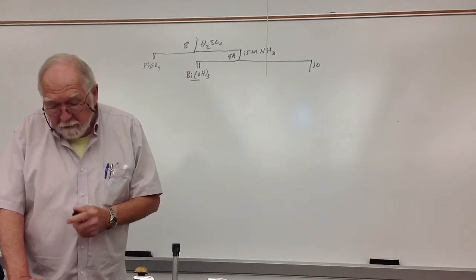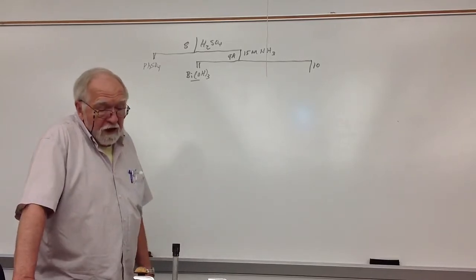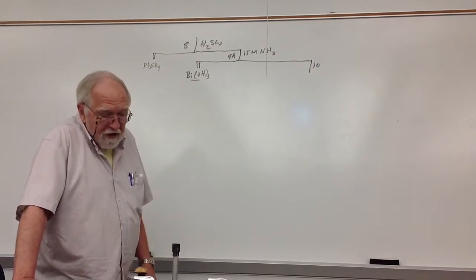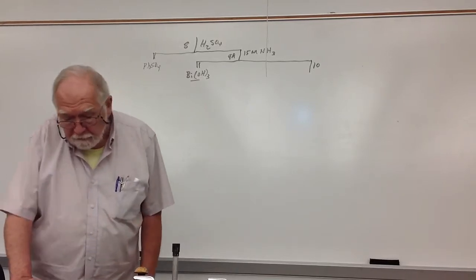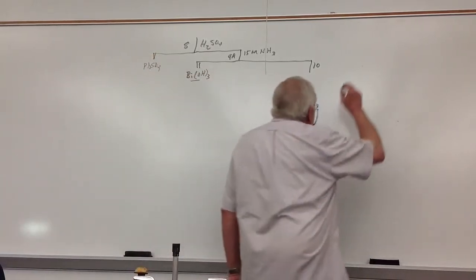The thing I pointed out about the tin 2 chloride, I also mentioned this way back when you did the mercury test. Don't suck up the little pellets of tin in there. And if it's all white and cloudy, something broke down and you want me to refill the bottle with fresh reagent. Okay. So what's going to happen here, we have bismuth 3 hydroxide.